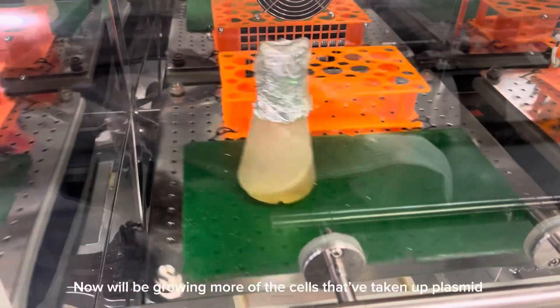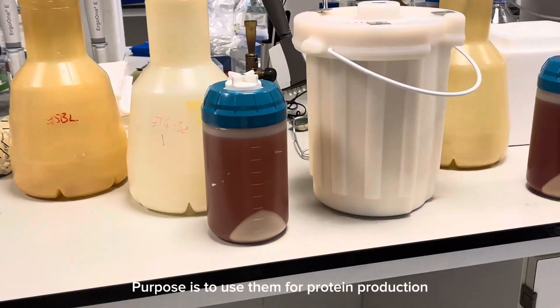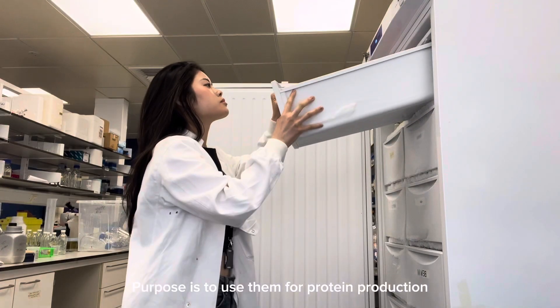We've picked some colonies and now we're growing more of those cells which have taken up the plasmids, and we will grow more of them to produce our protein.